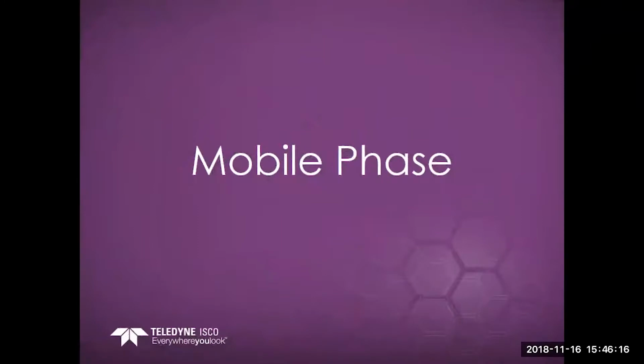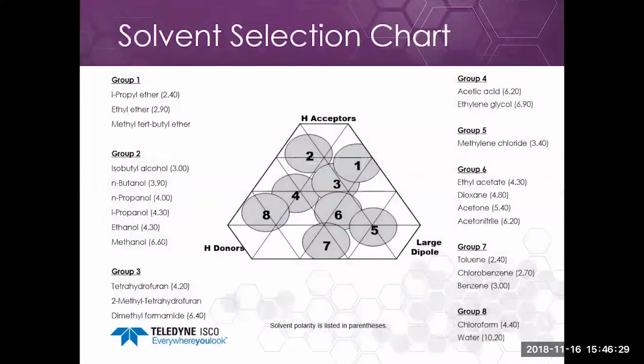The next segment I'd like to discuss is mobile phase selection. This is going to discuss choices that will allow us to make some substitutions. For the solid stationary phase, I think we were making mostly changes that would reduce solvent use, so that would be positive and have a big impact, but we could also substitute some solvents.